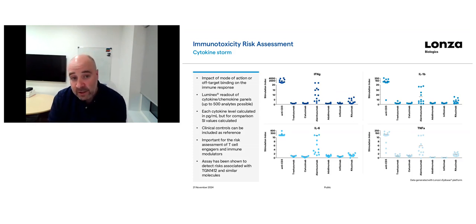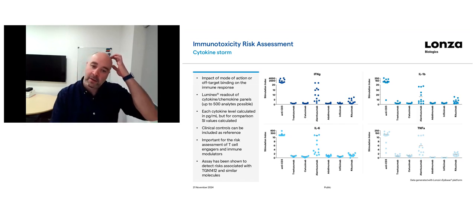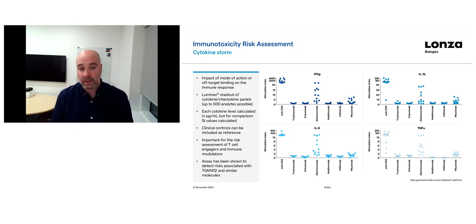And there is a little bit of case study data here. So we're always trying to benchmark these assays with clinical products. There's a range of antibodies you'll see here that are familiar to most people here, I would imagine. They're widely used in the clinic. Some of them, like alemtuzumab and rituximab, are known to give cytokine infusion-related reactions due to their mode of action. As you can see, we've just got interferon, IL-1, IL-6, and TNF shown here. And you can see a very similar pattern where we can see differences or increases in most of these cytokines to alemtuzumab and then slightly less to rituximab, but you can still see it's higher than the lower risk controls, like cetuximab, for example. And then we have more strong polyclonal controls like anti-CD3 antibodies or anti-CD28 antibodies that are known to give full-blown cytokine storms in patients due to the mode of action.